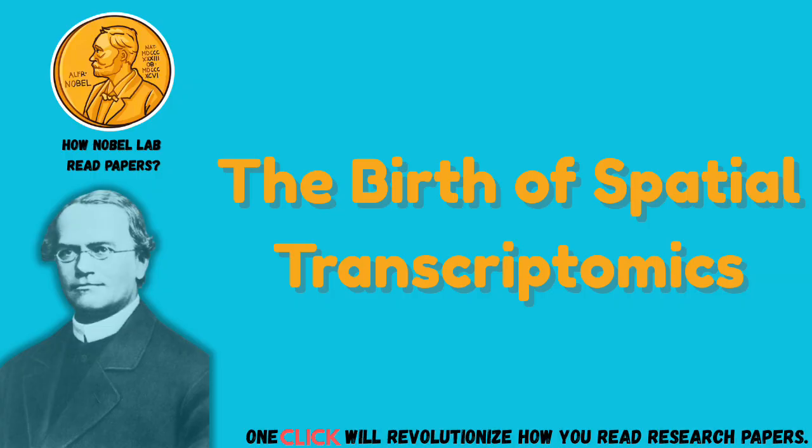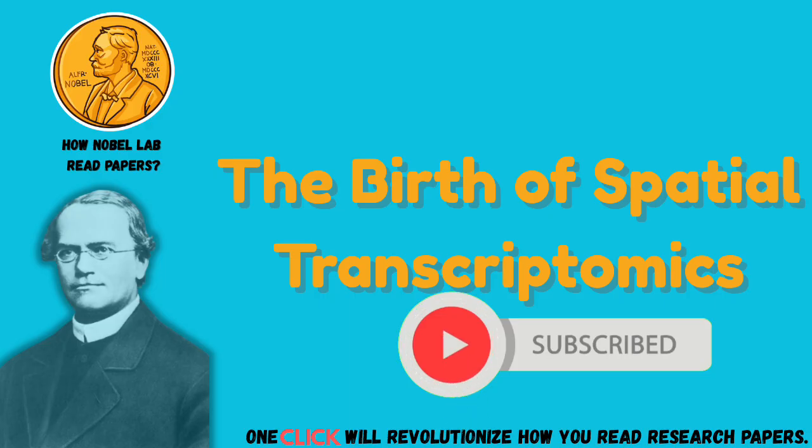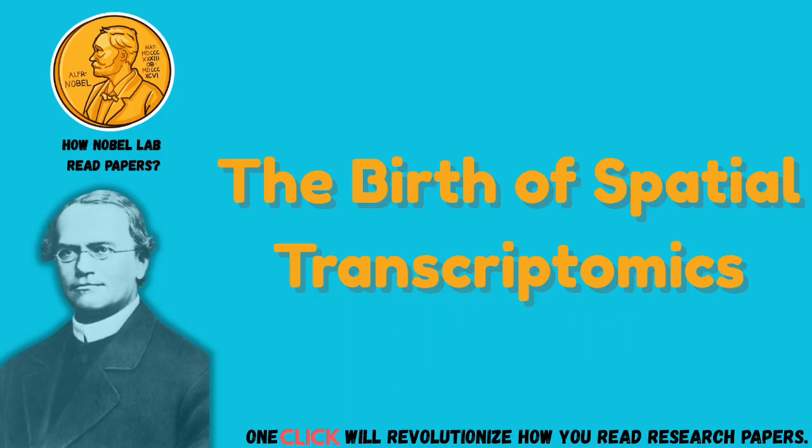So looking forward, what was the big innovation here? This paper basically established the whole coordinate-coded cDNA idea, didn't it? It launched the entire modern field of spatial transcriptomics. It turned RNA-seq into this discovery-driven tool where you can find tissue domains you didn't even know existed. And one of the coolest things is that the data you get is, well, it's permanent. It's a permanent resource. You do the experiment once, and you have this full digital map of the tissue slice's transcriptome. You can go back and requery it computationally for any new gene, any new question, years later.